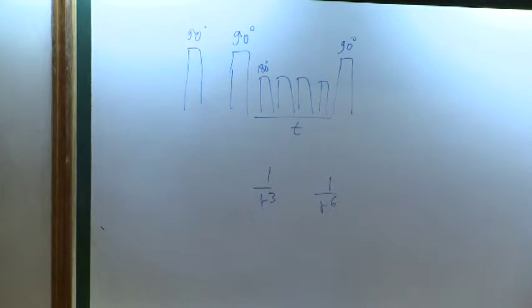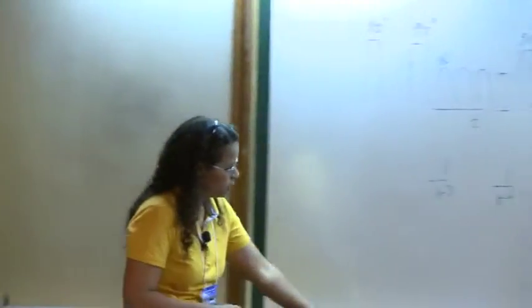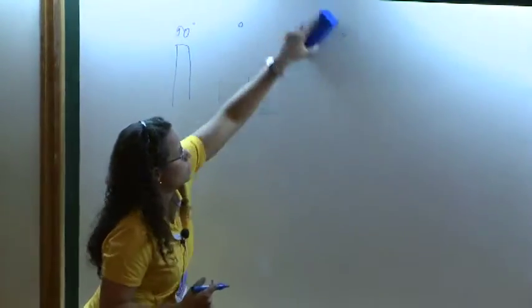Correct. But so then you said you had to distinguish between inter and intramolecular. After you used the RFDR, did you proceed to? But I'm not using this sequence for that. I'm using NHHC. I can use many of them, but I'm using this one.